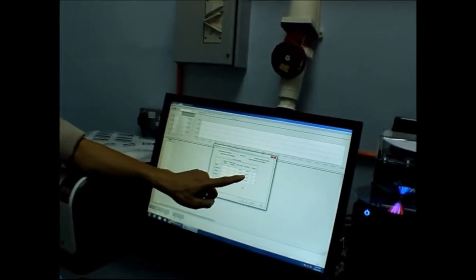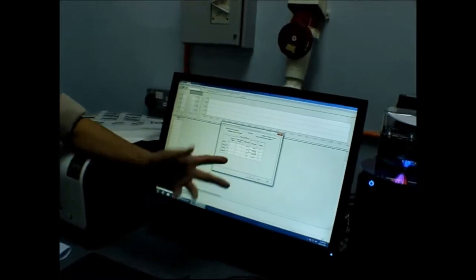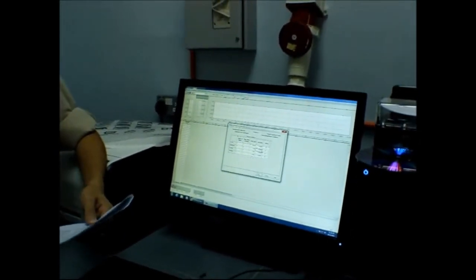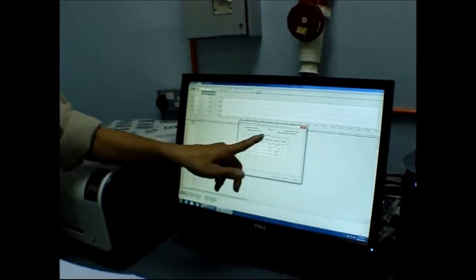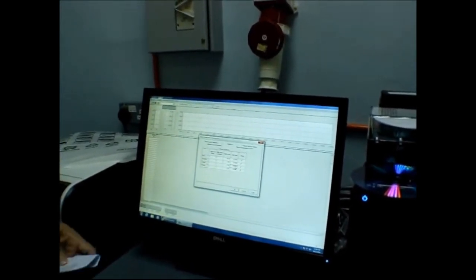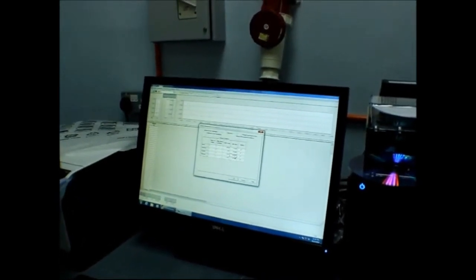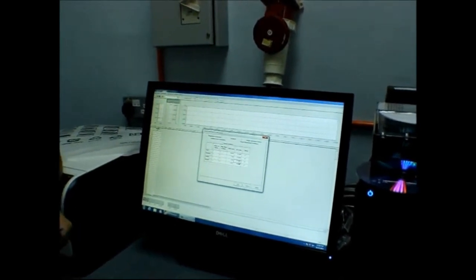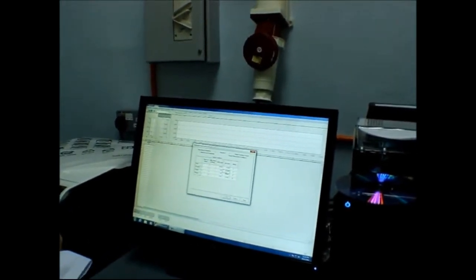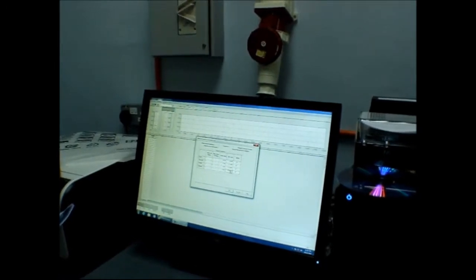So the SD limit depends on you. What is your limit? Or you don't want to set? You can put any number, maybe 1, 2, or 0.5. 0.05. This one should be lower, because your absorbance is quite low, 0 point something. It's not more than 1. 0.5 should be okay. 0.05 standard deviation is quite good. But don't set too low if you can. 0.1, okay, should be okay. Or you set 0.1.